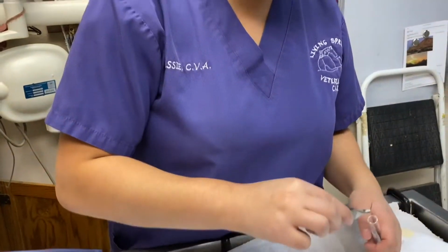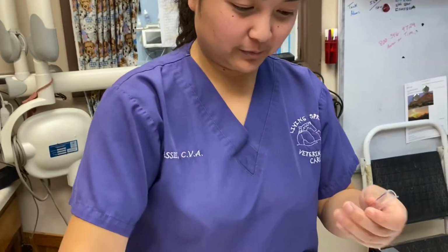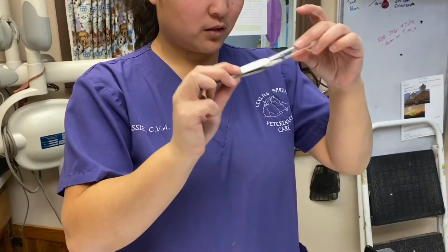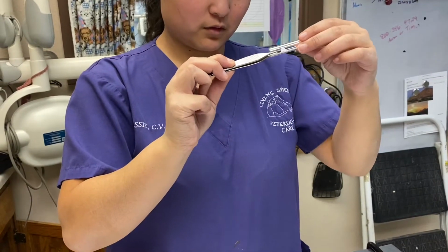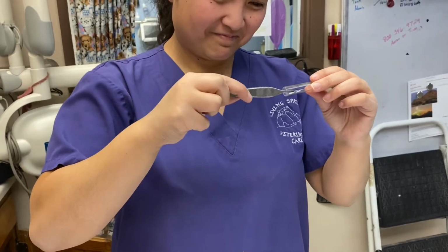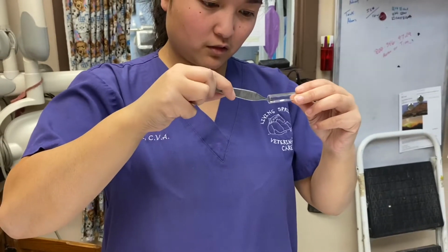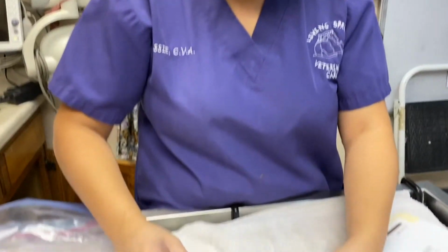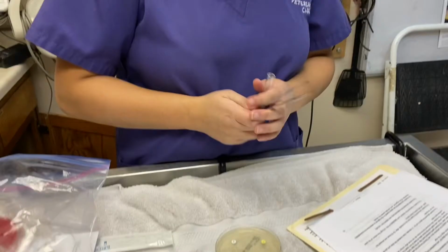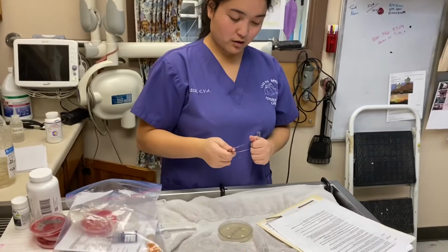Okay. And then the last one, which is right here. Okay, push that down. I'm going to let it sit for about a minute, and then I'm going to put it in the incubator and come back and check how it looks.